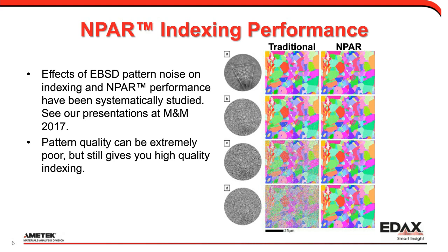And in the end, that's all really kind of an interesting thing to understand. Okay, what's going on with my IQ map? What's going on with my CAM map and different things like that. So again, it's a powerful tool to have in your tool set, and that's really what NPAR is.